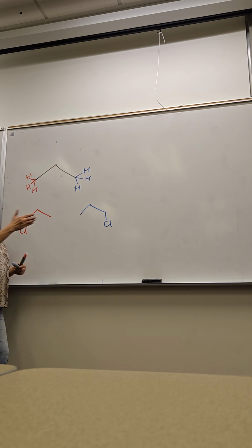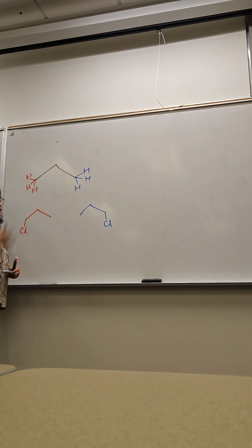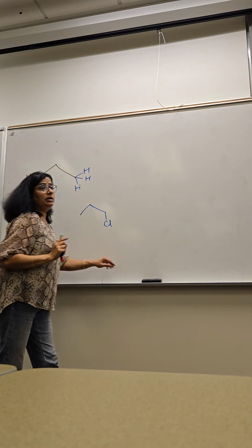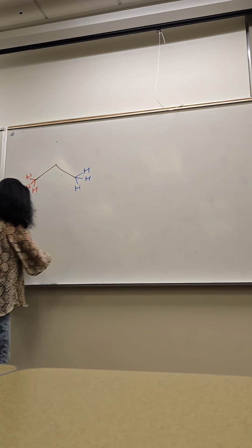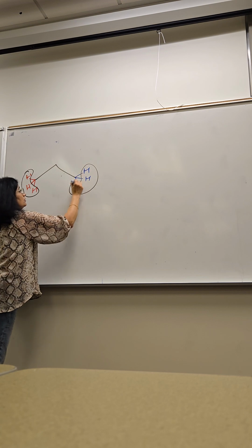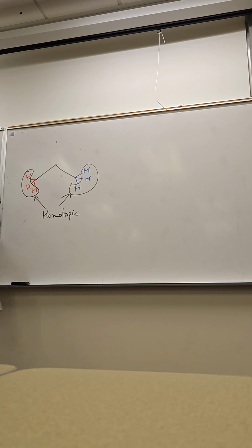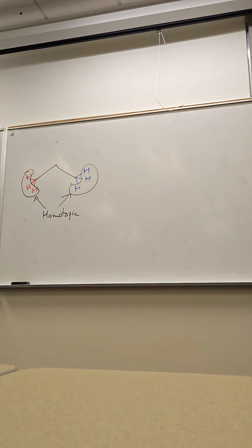There's a quick check for that too. What does this molecule have? Plane of symmetry. Because of that plane of symmetry, this is identical to that. Everyone with me? So, would you be okay if I said all 6 of them are homotopic, meaning they will give us one signal? Okay.